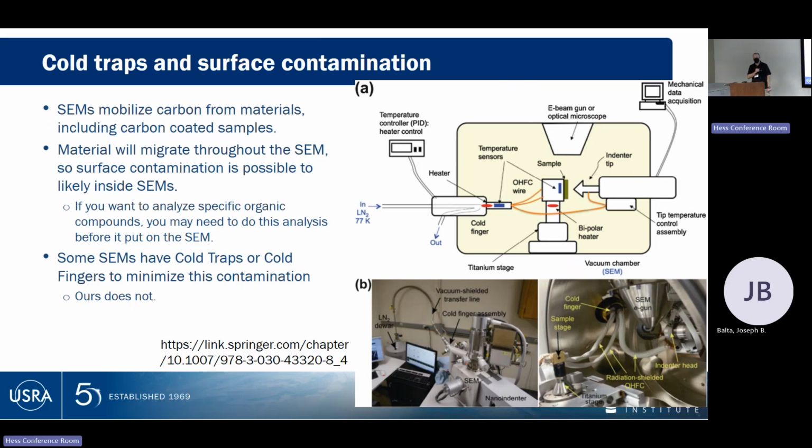Migration of stuff through an SEM, including an environmental mode, is a factor that you may need to deal with. If you have a sample that's actively degassing during your analysis, you don't necessarily want all that getting pumped through your vacuum. You don't necessarily want that getting pumped through your column. If you're doing that in variable pressure mode, you're letting some degassing happen, and then some of that gas is actually entering the column because none of those apertures are perfect.